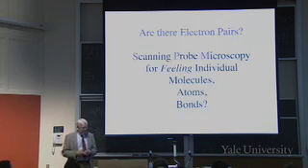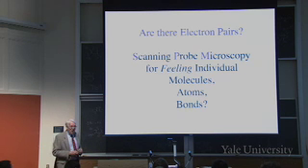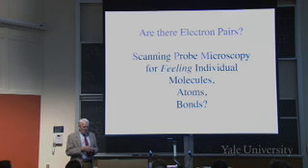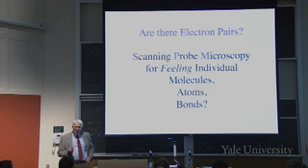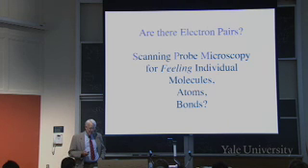Okay. So we have this question, are there electron pairs? So let's try first feeling with scanning probe microscopy, or SPM. Can we feel individual molecules? Can we feel individual atoms? Can we see what bonds are by feeling them?